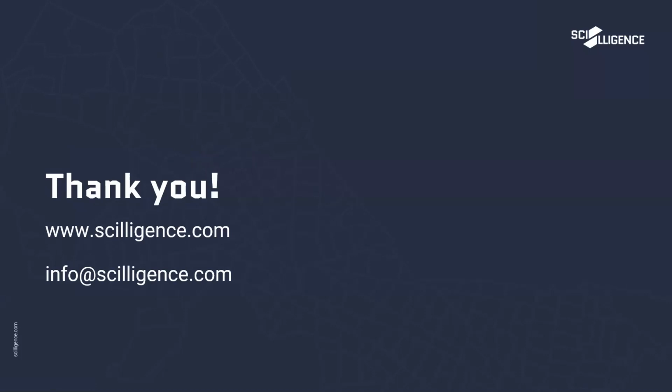So, okay, good question. Card is not an add-on for Focus. It's a new feature that will be coming out soon in the latest version of Focus. And Jim may correct me on the availability of that. I need to ask our developers if it's currently available or if it will be implemented soon. And your second question, I'm sorry, what was your second question?